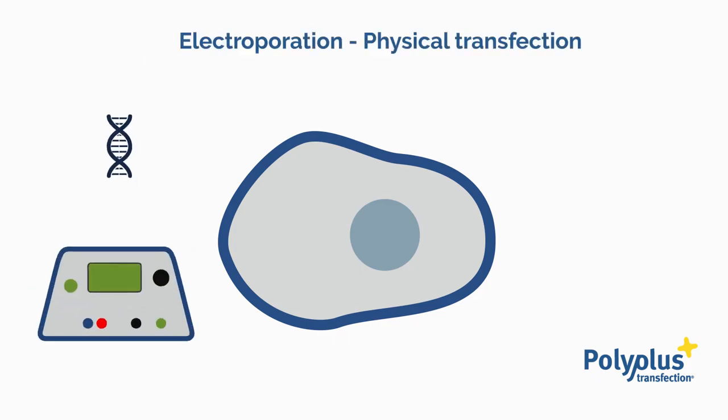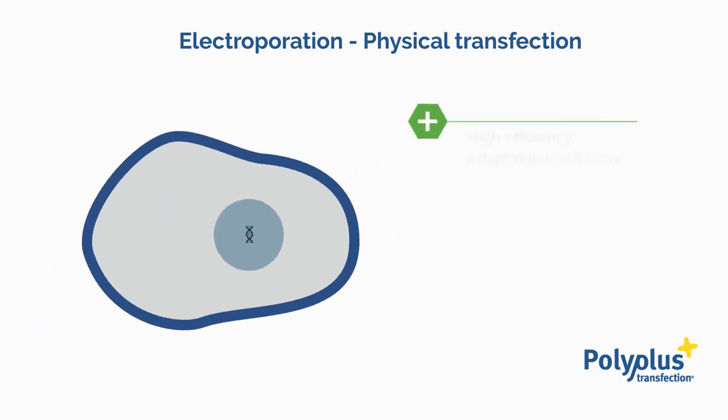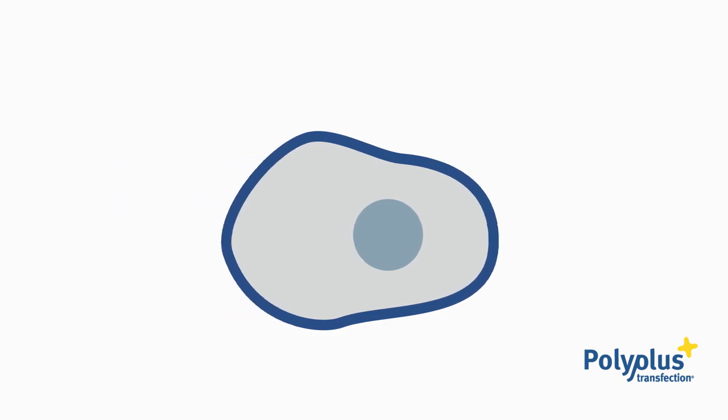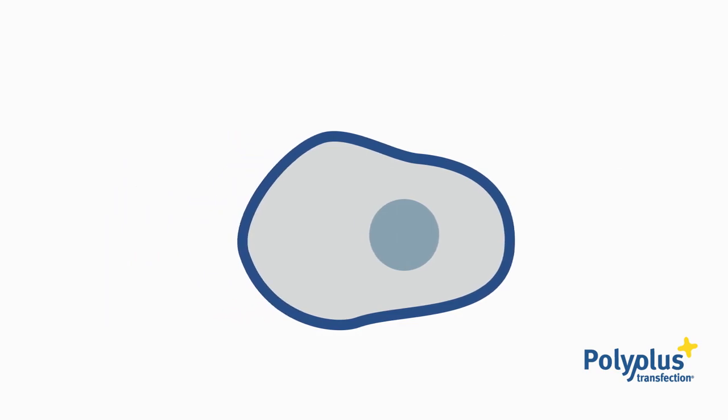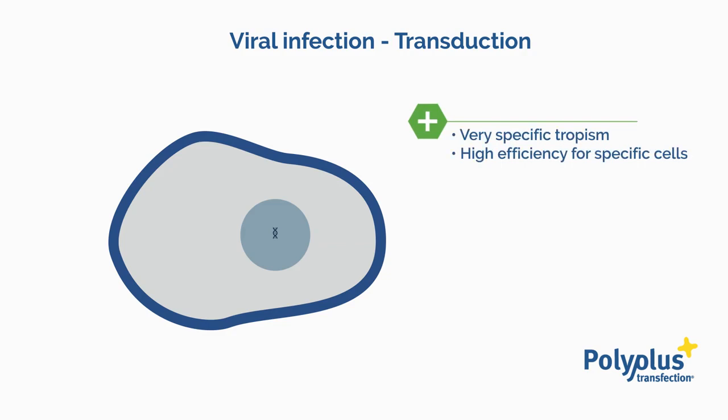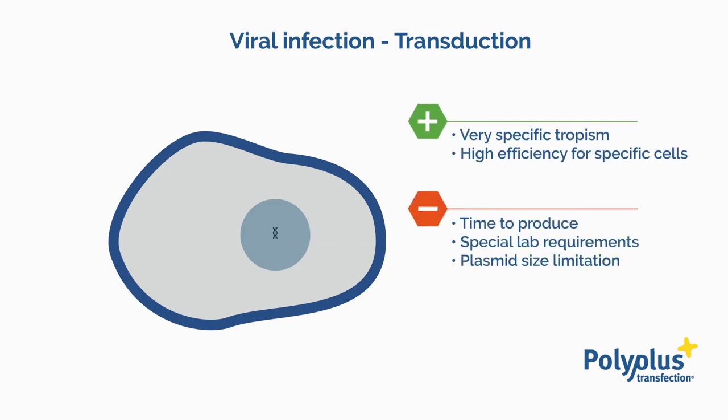Electroporation corresponds to the use of high-voltage electric shocks to introduce nucleic acids into cells by creating pores. When these pores stay open, cell homeostasis is lost and cells die, which is the main drawback of this approach. Transduction refers to virus-based delivery of nucleic acids in cells. Scientists insert genetic material into the genome of the virus, which requires expertise and specific lab biosafety levels.